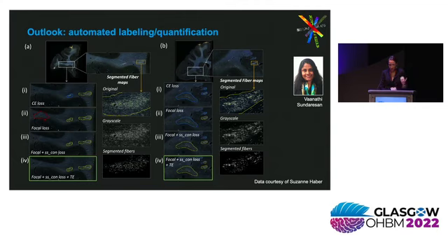So these are some very preliminary results where she has trained a dual task network to both segment the outlines of the fiber bundles and segment the fibers from the background within the bundles, which is important because, as we saw, in some bundles, the fibers will be very close to each other, and in others, there'll be gaps. So this is a first step towards being able to quantify these things, as well as to accelerate the pace and the number of different cases that we can use for validation studies.